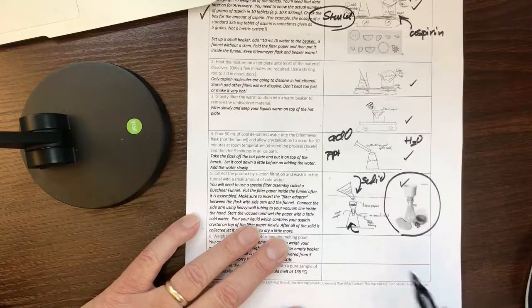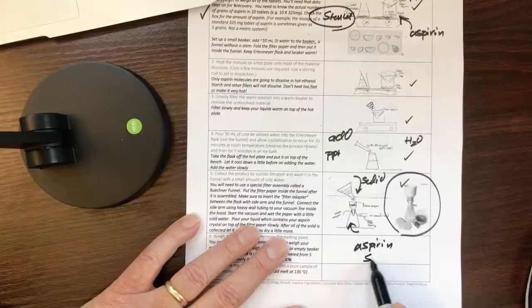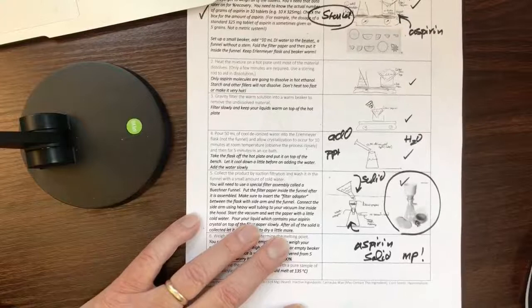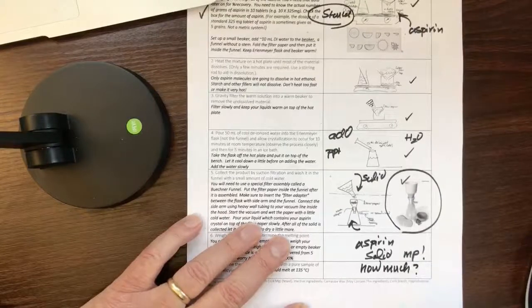And then we take the aspirin as a solid and measure the melting point, not boiling point, melting point. We see what they report and see how much we have. So that helps us with the recovery.